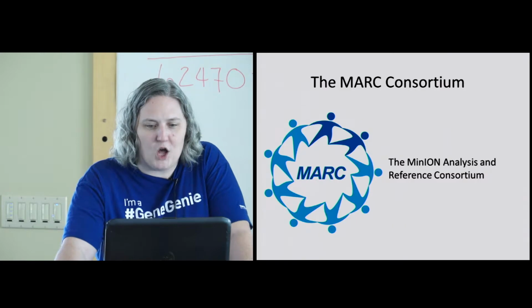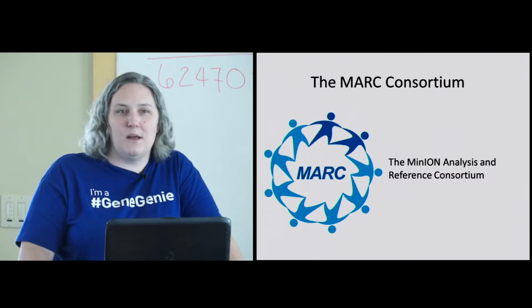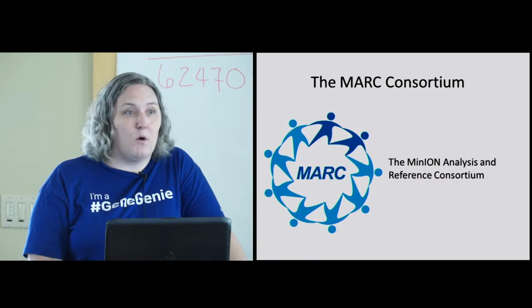Recently, our group has been involved with the MARC Consortium. This is the MinION Analysis and Reference Consortium. The goal of this group is to evaluate and display the functionality or lack thereof of the Oxford Nanopore MinION device.